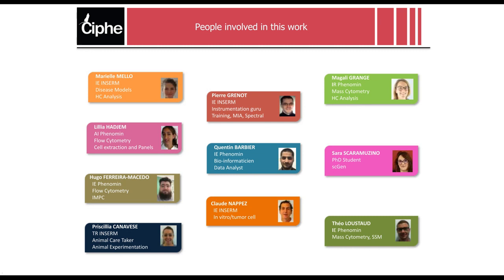Thank you, Dr. LUCHE. Our next question: what is the most interesting feature of the Cytobank platform in your views compared to the others?